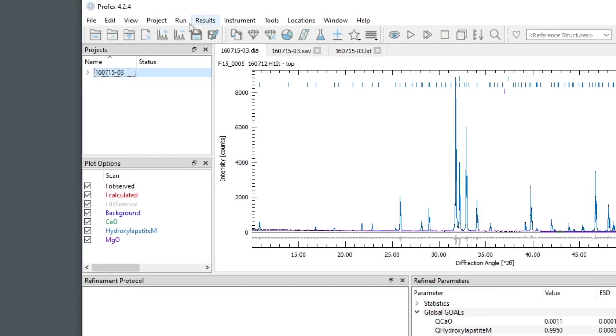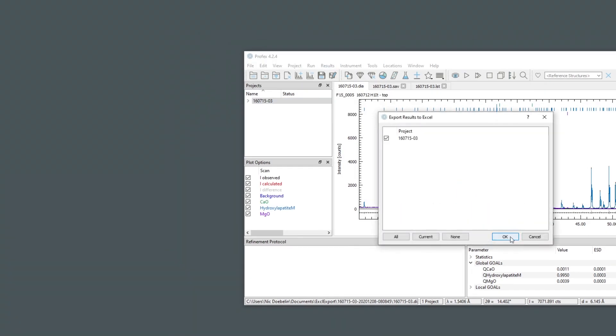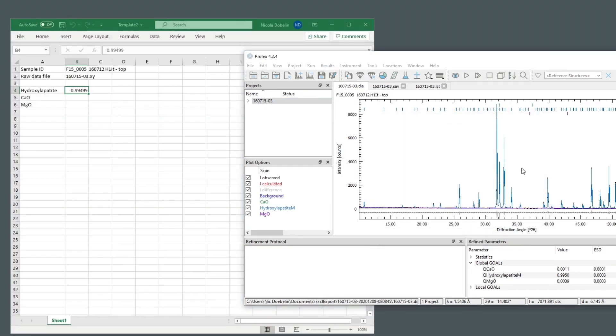And if I export the results, I get exactly what we configured.